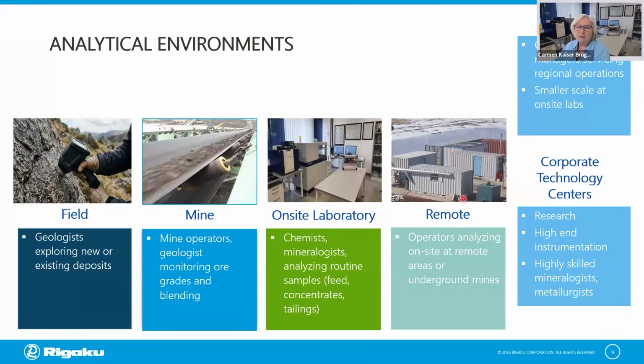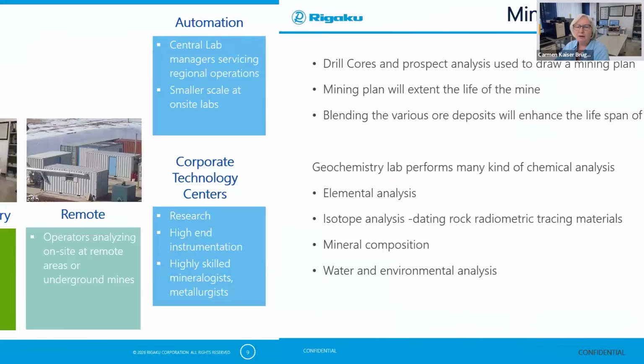And then we also have on-site remote laboratories, which are container laboratories, where the operators analyze on-site or in very remote areas or even underground mines. And then we, of course, get the automation part and the technology centers where mainly the research occurs.